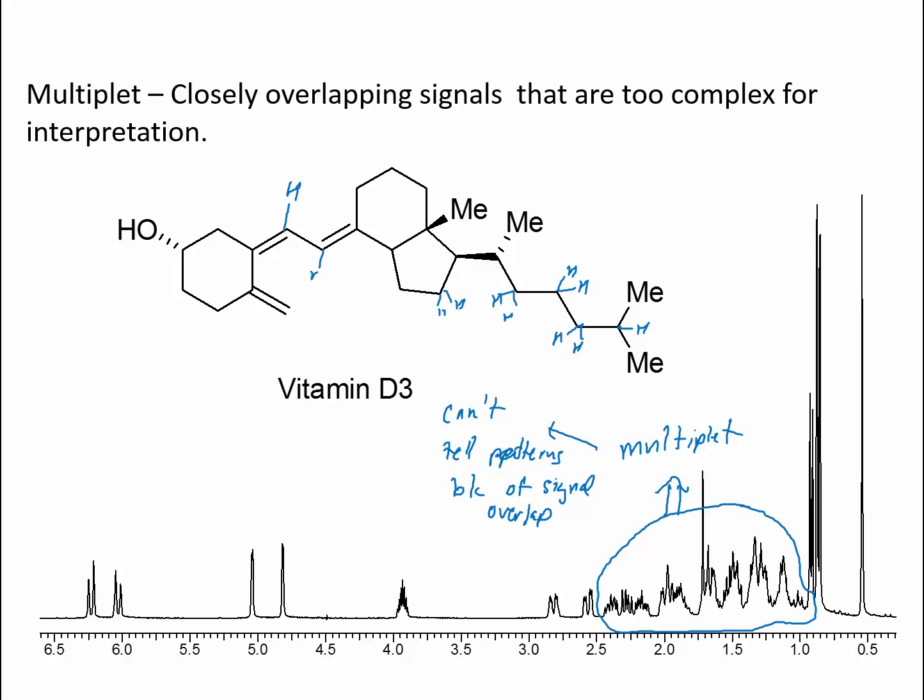These two hydrogens are alkene hydrogens, and they're doublets. They're not equal to each other, therefore we're looking at these two hydrogens here. These two hydrogens are on the same carbon. This is actually only a 2-bond coupling because one of them's E, one of them's Z. They're not equal to each other.